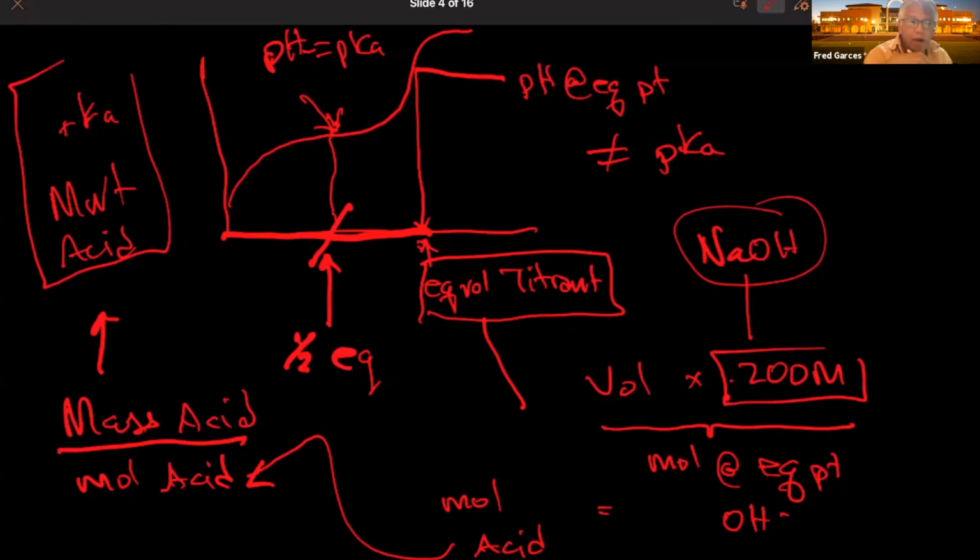It's a simple experiment. The experiment is tedious because you do have to do titration, and you always do a minimum of 3 trials in any experimental procedure. The reason why you do a minimum of 3 trials is, well, there's a couple of reasons. One is that you can reproduce your work. And so if the first one's high and the second one is in the near ballpark of the true answer, then the third one sort of establishes that.